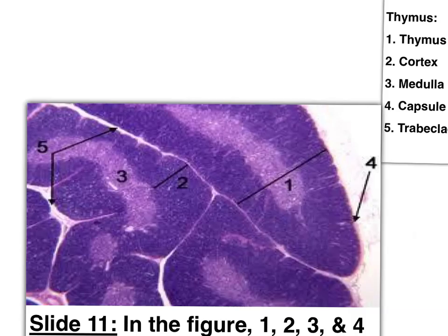The black arrow points to the capsule and the green marks the trabecula. The yellow star indicates the thymus medulla, and the red triangle points to one of the thymus lobules — there are two main lobes subdivided into lobules. Number 1 is the thymus lobule, number 2 is the cortex, number 3 is the medulla, number 4 is the outer capsule, and number 5 is the incomplete trabecula.